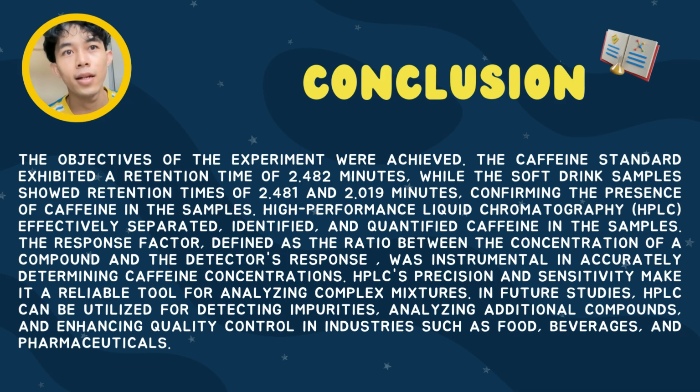The caffeine standard exhibited a retention time of 2.482 minutes, while the soft drink samples showed retention times of 2.481 and 2.019 minutes, confirming the presence of caffeine in the samples. High performance liquid chromatography, which is HPLC, can effectively separate, identify, and quantify caffeine in the samples.